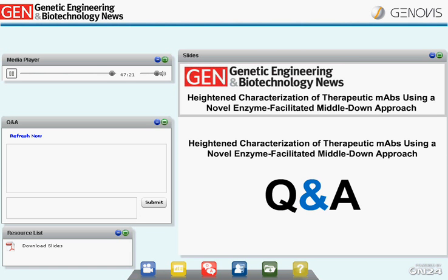All right, Rob, we're back to you. Someone wants to know, after reconstitution, how long can IdeS and FabRICATOR be stored at minus 20 degrees centigrade? Going based on experience, and certainly against the recommended storage conditions for the enzyme, we currently reconstitute the enzymes, aliquot them out and store them at minus 70, and we can store that for greater than 12 months.